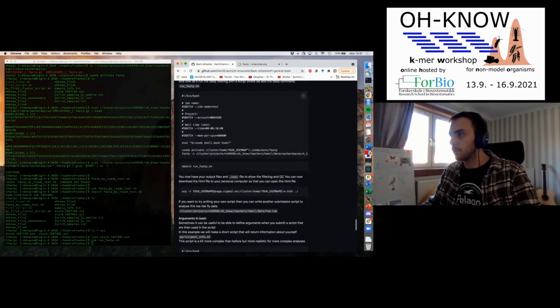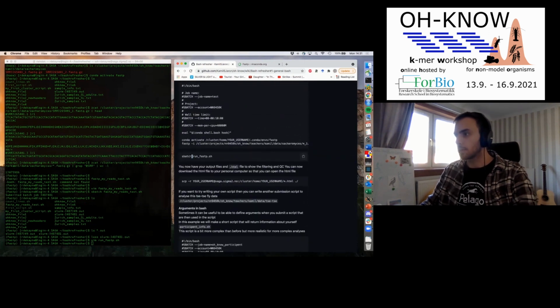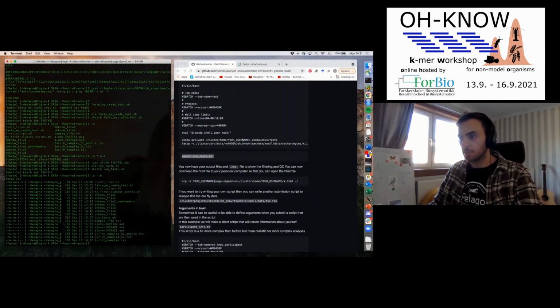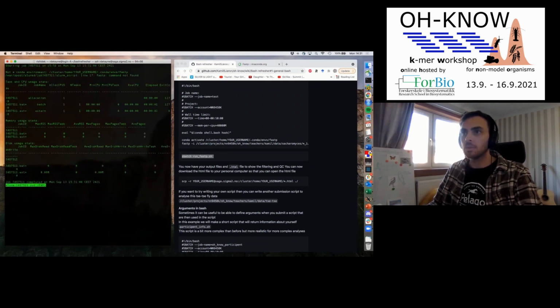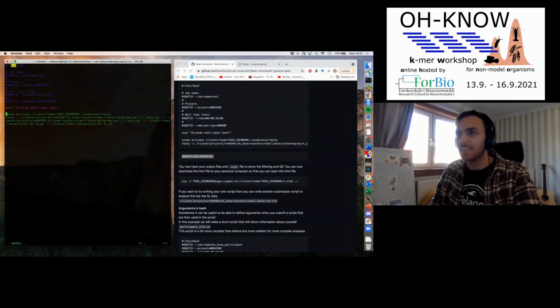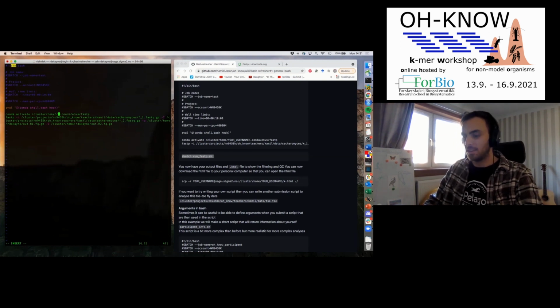So let's go back to our FastP run. We have this script. We're now going to do sbatch and run it. This one will take a little bit longer, I guess. We can see what the output is. Oh, not a Conda environment. Oh, classic. I made the exact mistake I told none of you to make. So we can edit this. Oh yeah, here this should not say your username in massive letters. It should say my name. Okay.